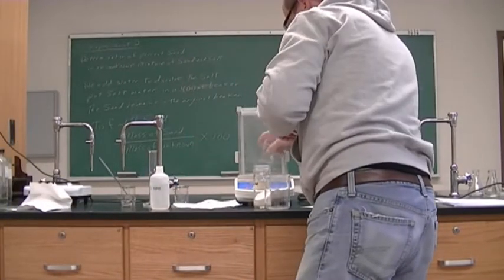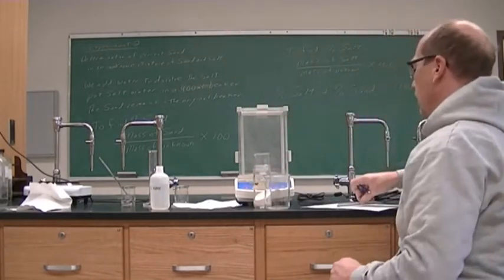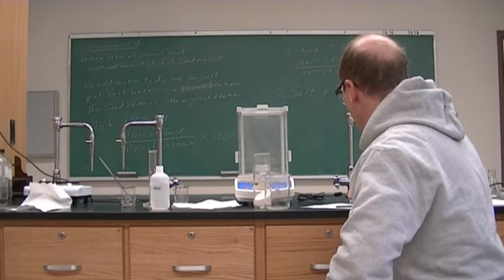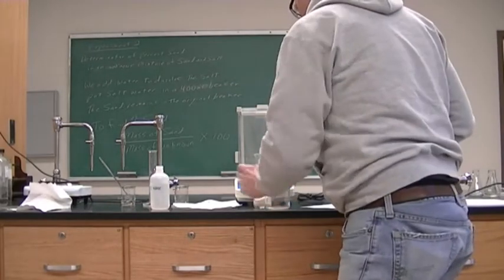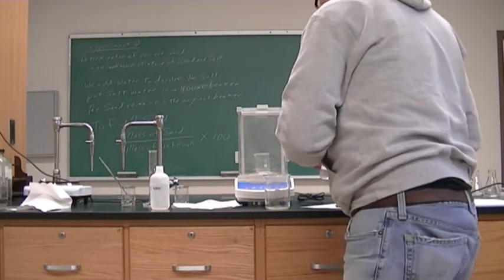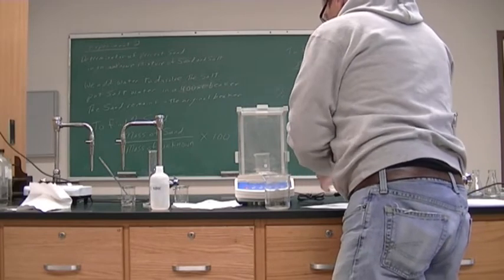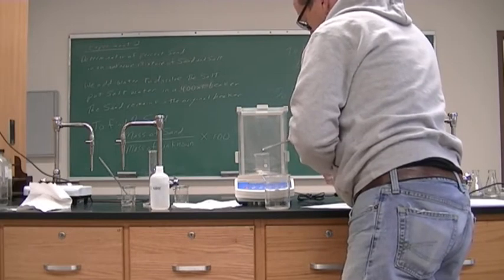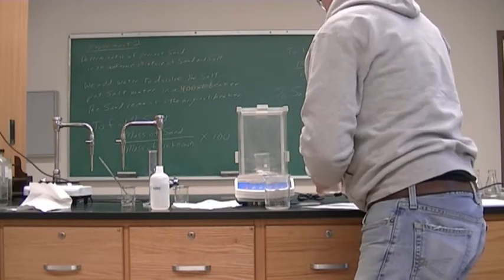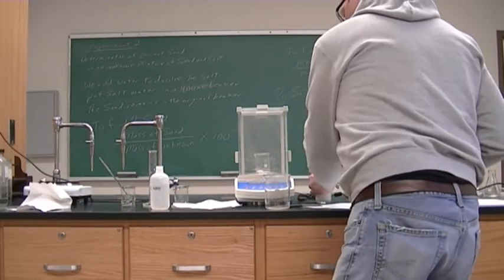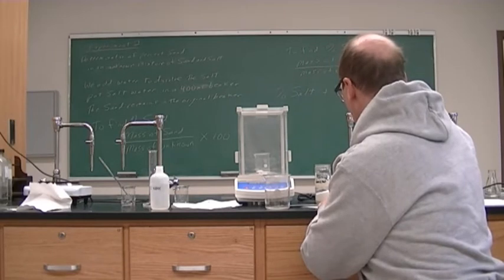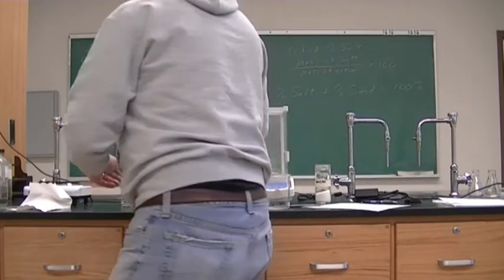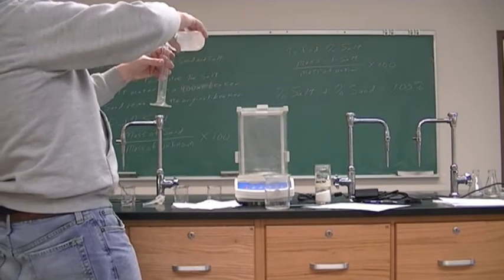We're going to go to beaker number 3, which is different from the first two, so it should have a much different mass. It is 50.5443 grams. We want to go until the scale reads about 52.5, so we'll add the unknown until it reaches approximately 52.5. This one is at 52.4700. We will add 15 ml of deionized water to that one.